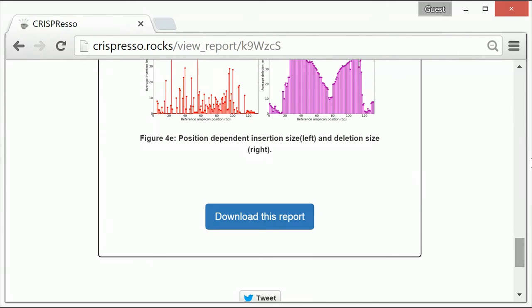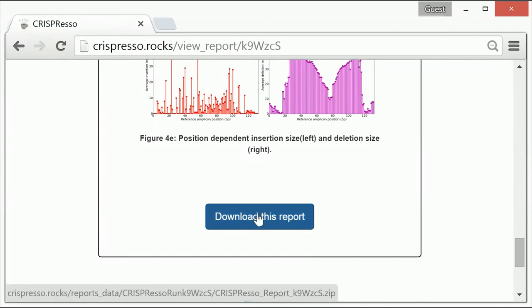You can save the files individually or you can simply click download this report at the bottom of the page, which will download all the analysis files.